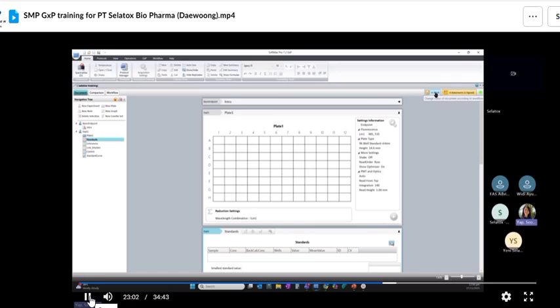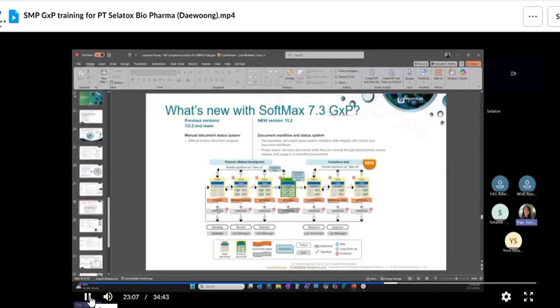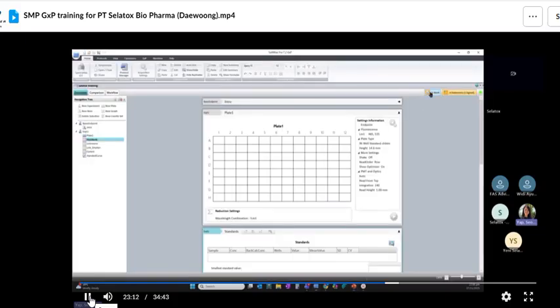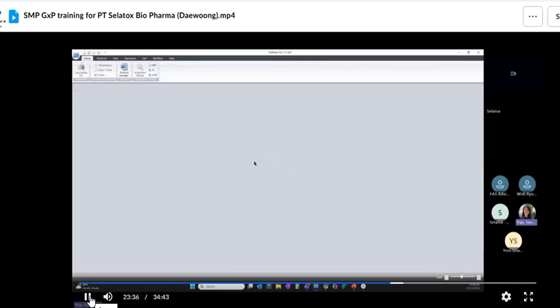So another thing you need to do is in order to move this to ask lab manager to approve, right? You need to change the statements in work to review pending. Okay, so which is here. In work here, you change it to review pending. Okay, please, you make some comment, yeah. Then again, confirm your username as well as the password. Okay. All right, so it auto log off.